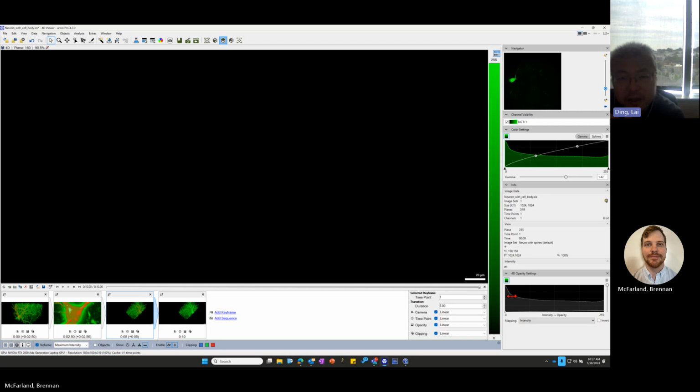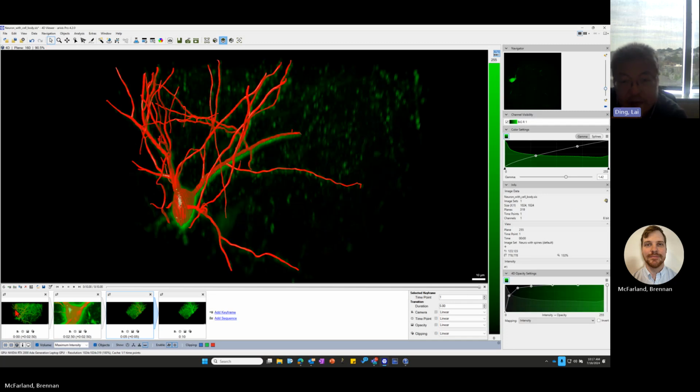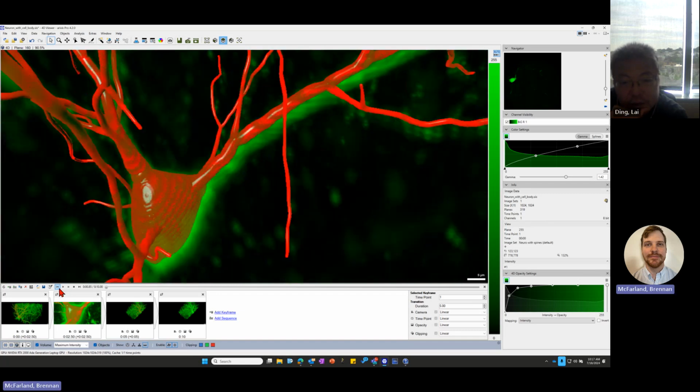Can you play the movie again? I just want to say, like, when the surface rendering is off, you know? Yep. Here.